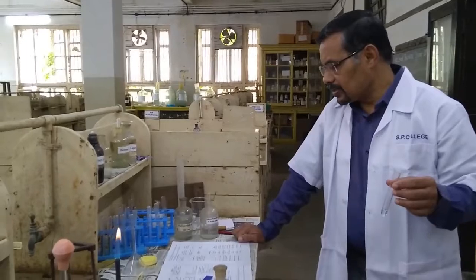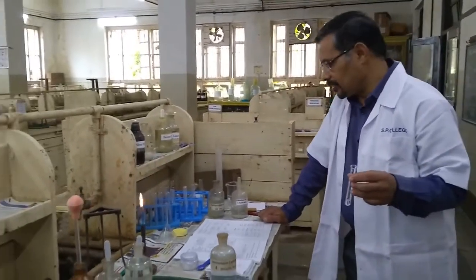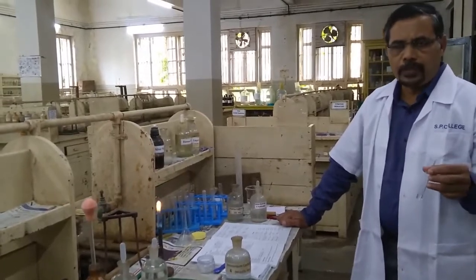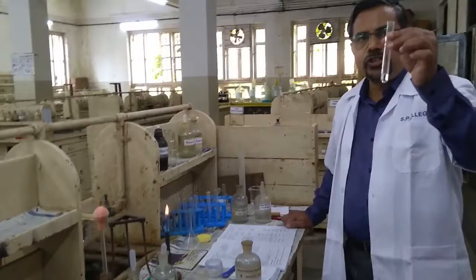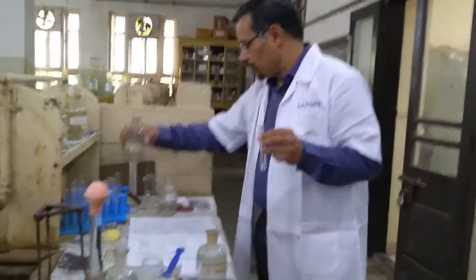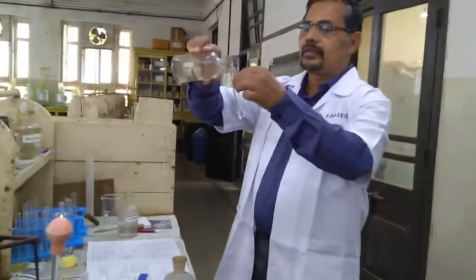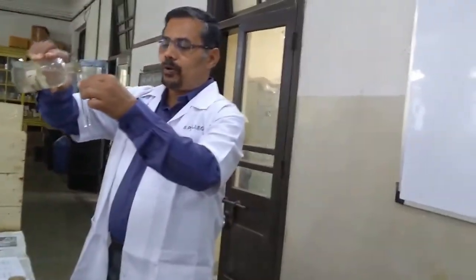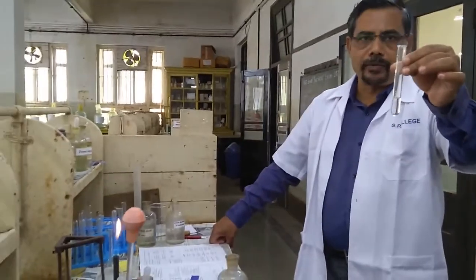Now we will study the next step in the analysis, detection of group. So the first group test is, this is the original solution. I will add a small quantity of dilute HCl, hydrochloric acid, in this. Then there is no formation of precipitate, simply a solution is there. So this indicates the absence of group 1.